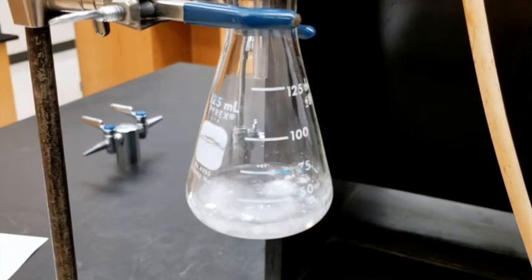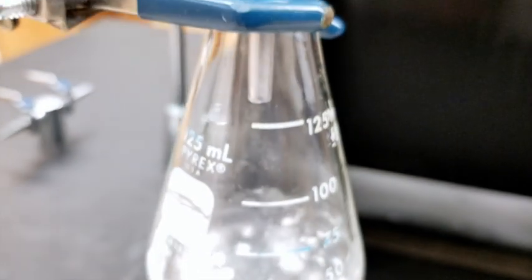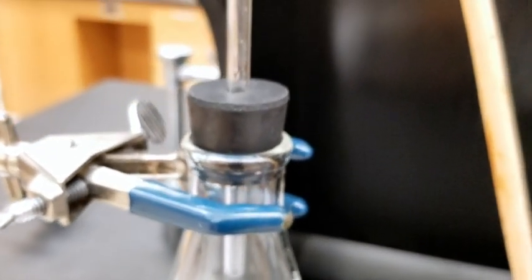Drop all the pieces of the tablet and all the powder into the Erlenmeyer flask that has the hydrochloric acid, and immediately seal this container with your rubber stopper and the gas tubing.